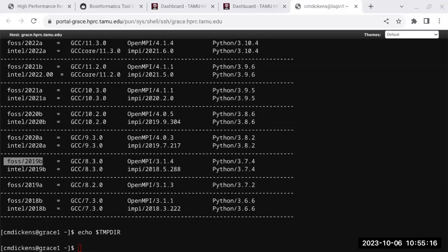You can run this directly. The job script has the example files already. So if you want to get used to or get familiar with running job scripts, or just see how other people have created job scripts and what can be useful inside of a job script, these are good templates. To access this, you just run the command GCA templates.